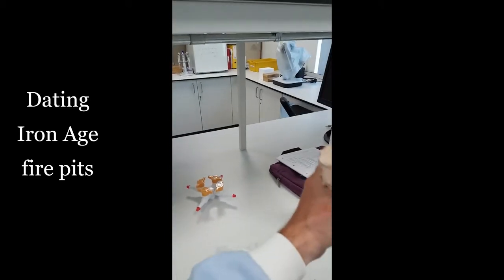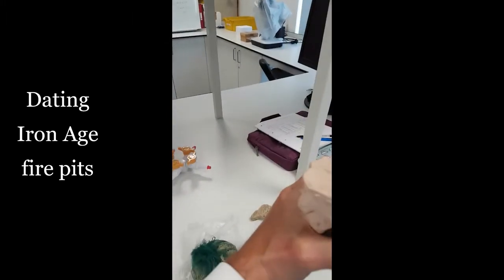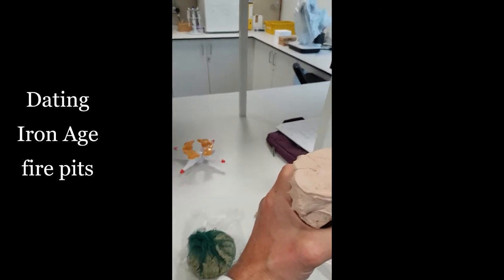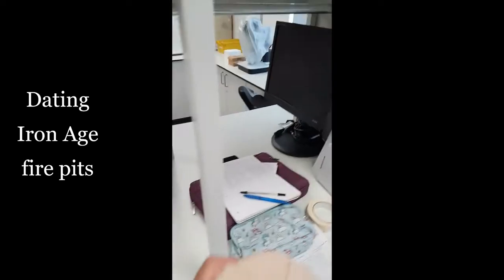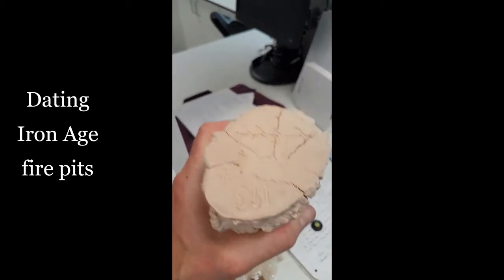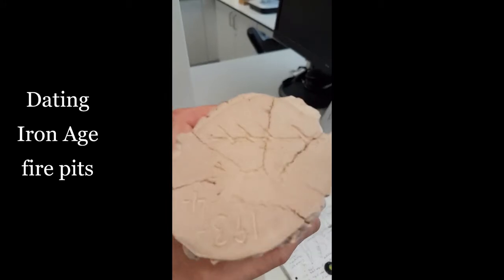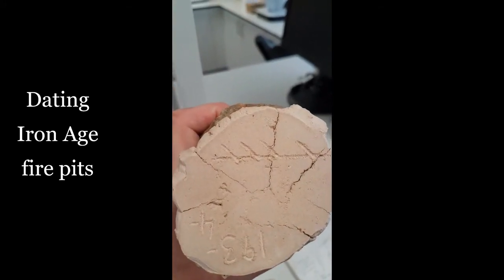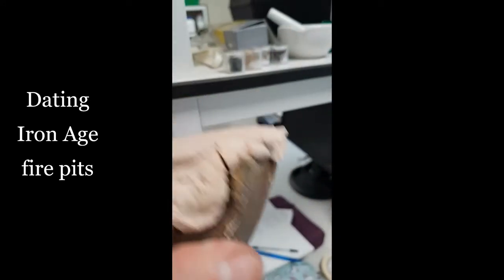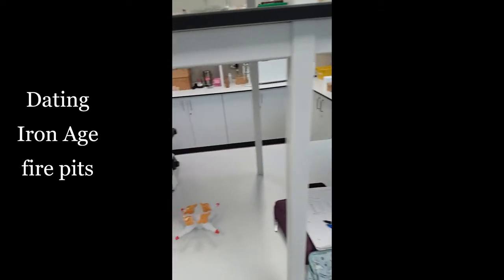This was embedded in the remains of the fire pit, so it was there in situ. They excavated the remains. I went along to the site and I put on this dollop of plaster. I made a flat surface, so I know that this surface of plaster is horizontal. Can you see that little line marked on there? That's the direction of the present day magnetic north. So once I've oriented my sample, I take it out, bring it to the lab.